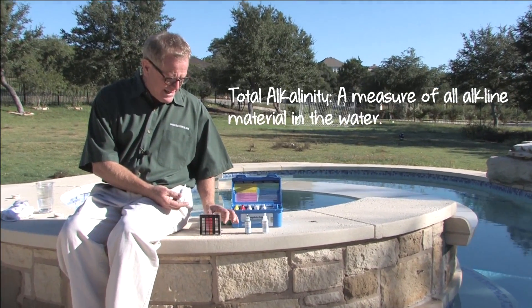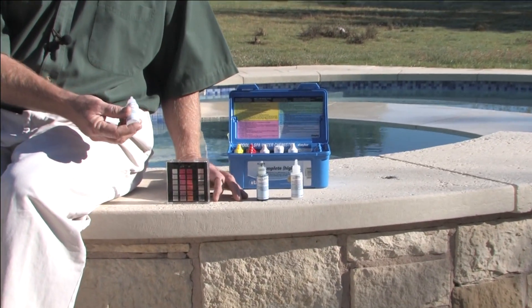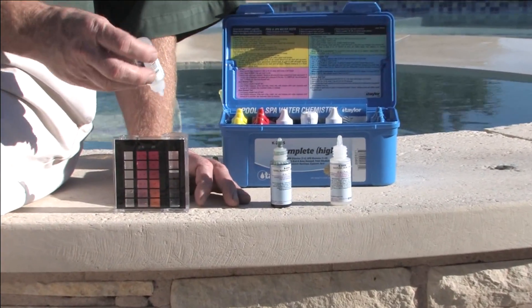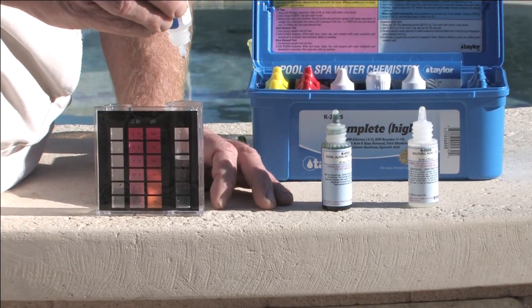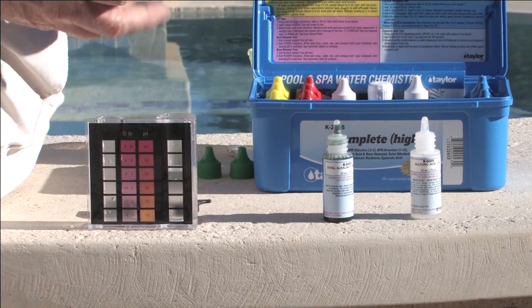First, we want to make sure that we get rid of any chlorine that might be in this vial. So number 7 is sodium thiosulfate, a chlorine neutralizer. A couple of drops, swirling around.